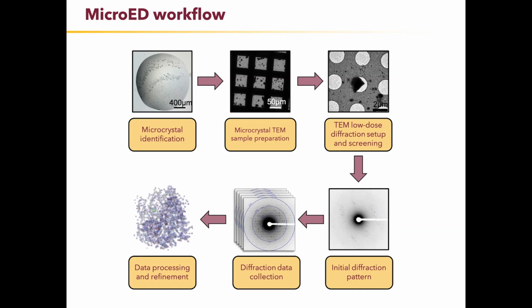So any dead time while the detector reads out, you're going to be missing data. So you need a high-speed, high-quality detector for this. And I can answer any questions later about what kind of detectors those might be. Once you get these data, you convert them into file formats that data processing programs can recognize.